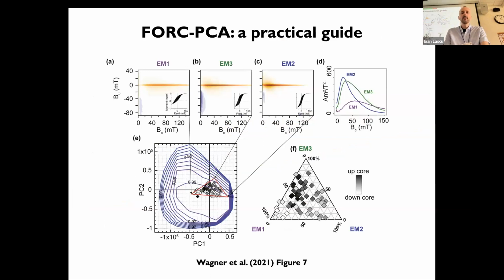All right, so having said that, before we go to our practical demonstration, are there any questions or any comments or additions? We are going to try to reproduce this figure from Courtney's 2021 paper in Paleoceanography. Any questions so far? Yes.